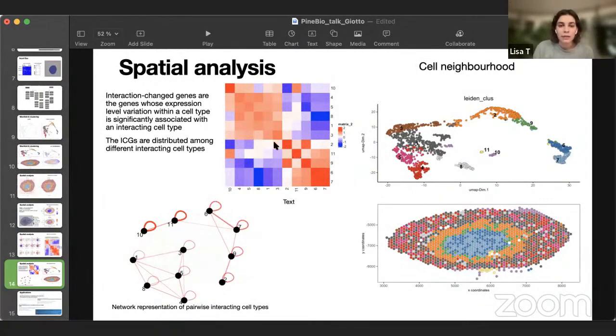We can see, for example, that clusters 4, 5, 8, 1, and 3 are all here. They aren't really correlating even to each other very well. And for example, clusters 10 and 11, these are small ones, located here and here. They have very strong interaction inside the cluster and not so much with other clusters. Well, they interact with each other as well.